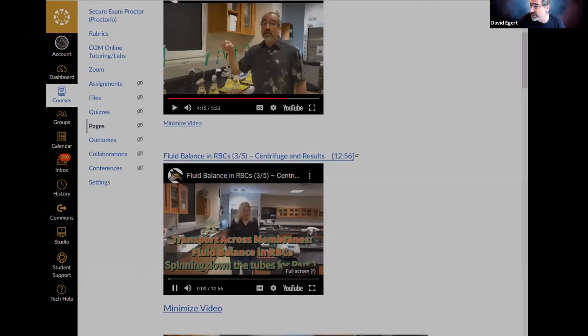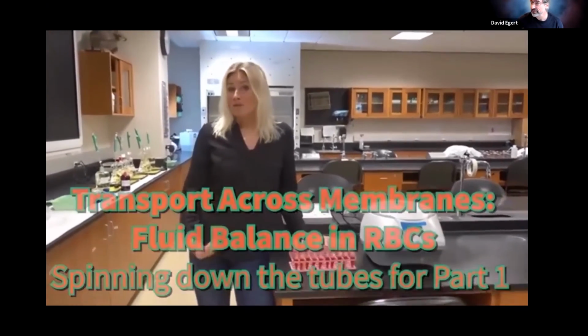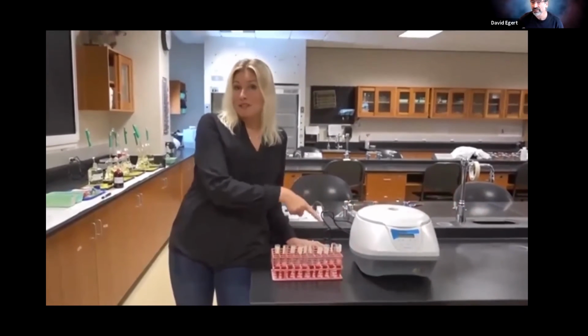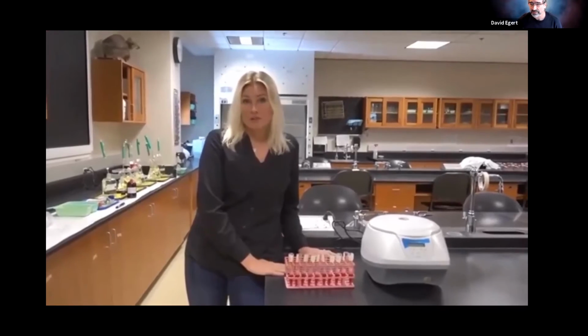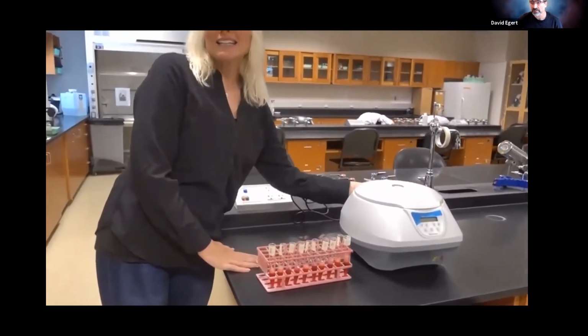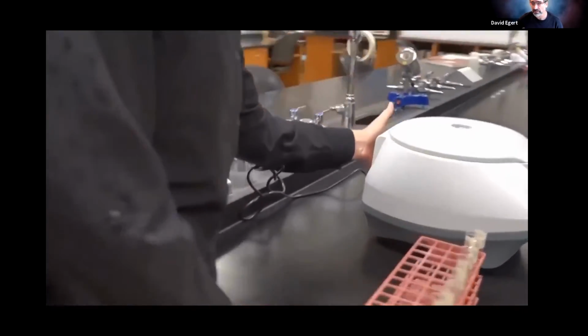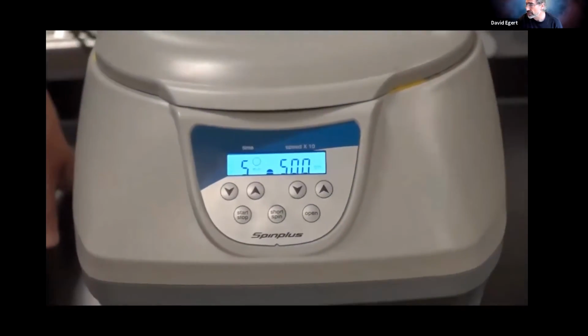All right, so next we're going to centrifuge these test tubes. Unfortunately, we have more test tubes than we can finish in one round. But let's start off with how to use the centrifuge. So number 1, make sure it's plugged in. Number two, on the back side of the centrifuge, you have a switch. And so now it's on right there. And then once it's on, the display will light up. And it should already be set on the settings that you need.